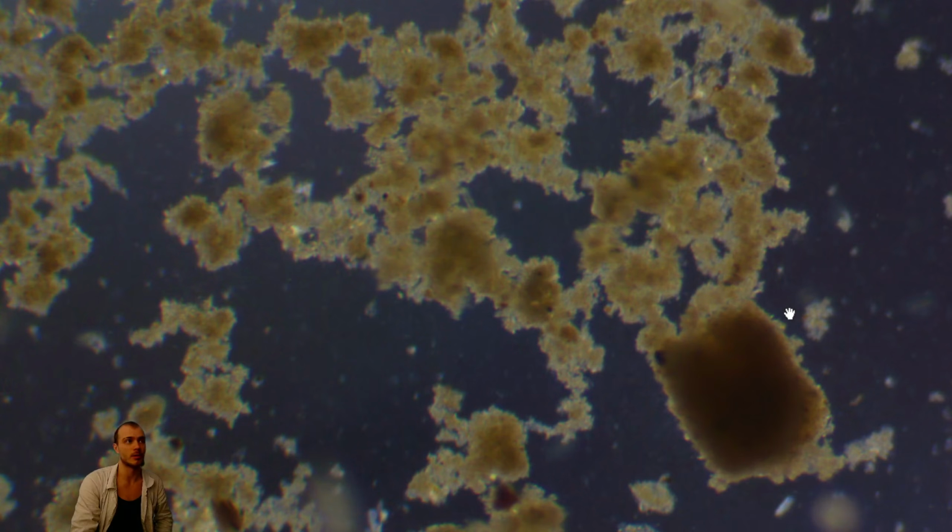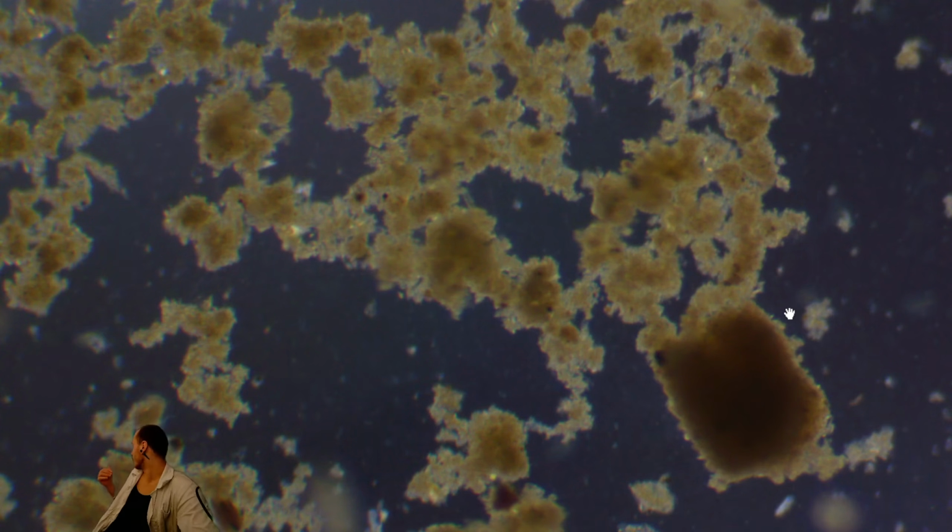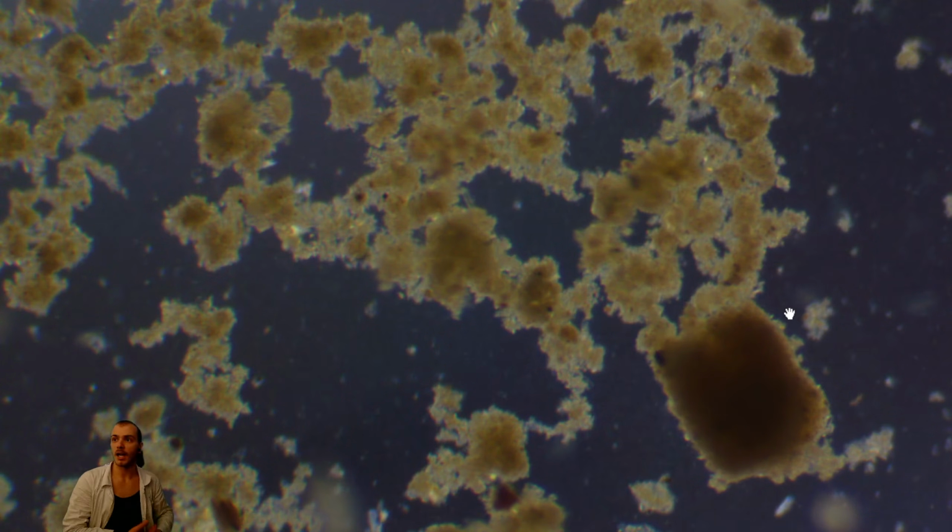I noticed ostracods in my biggest sample, which is the aquarium. I didn't have ostracods here since the winter, so I think they hatched from something like eggs.